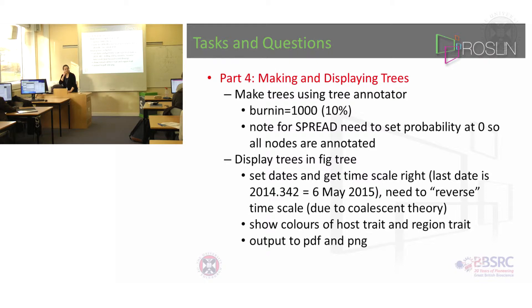The important thing to notice is what the last date is, because you have to set that in FigTree. This date here is 2014.342, which is actually the 6th of May. And because of coalescent theory, to make it display properly in FigTree, you have to reverse the timescales, and I will show you how you do that.